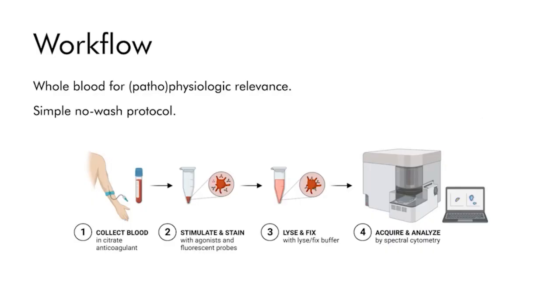So there is a simple no-wash workflow that requires whole blood collected in sodium citrate. Blood is incubated with a cocktail of platelet agonists and fluorescent reagents for 30 minutes, fixed and lysed for 10 minutes, and then acquired by spectral cytometry.